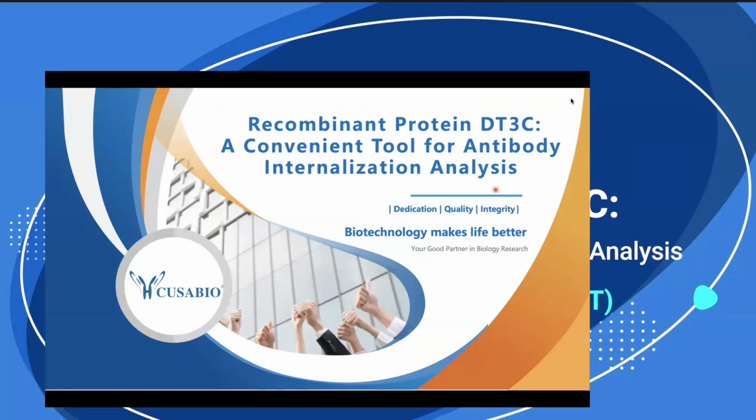It's my pleasure to have this chance to meet you in this webinar and share knowledge about recombinant protein DT3C and its role in analyzing the antibody internalization efficiency in ADC drug development. After my presentation, please feel free to ask questions and share ideas with us. So, going back to today's topic.